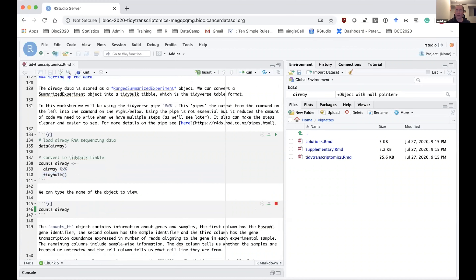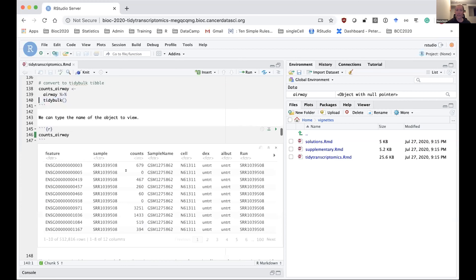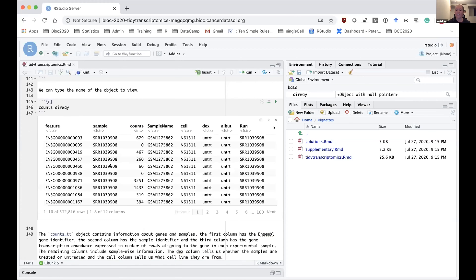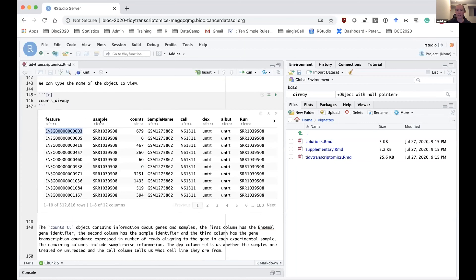Let's have a look at what that looks like — I'm just typing the name of the object I've created. As you can see, it's in a table format. Here we have our gene IDs, our sample IDs, and our counts. The other columns we're going to be using are the cell column, which tells us which cell line the sample is from, and also the dex column, which tells us whether the samples are untreated or treated.